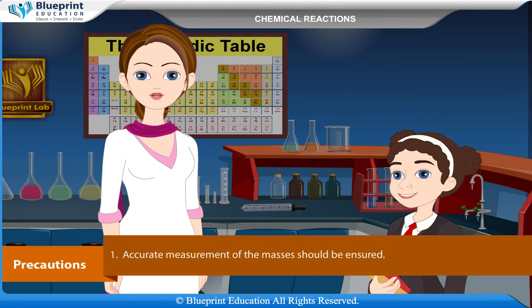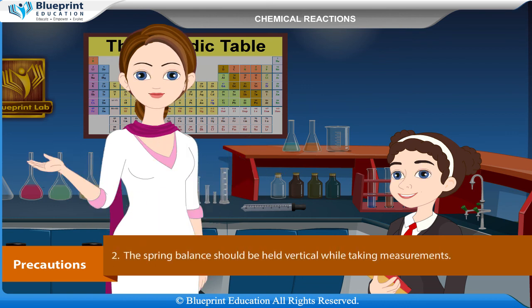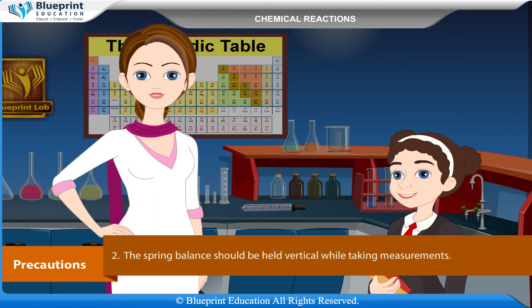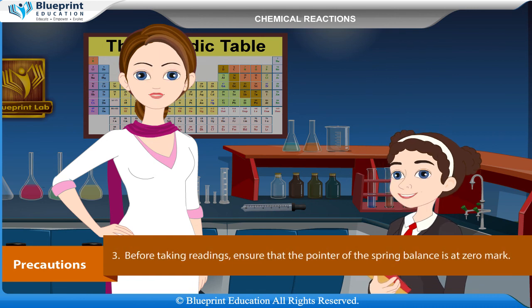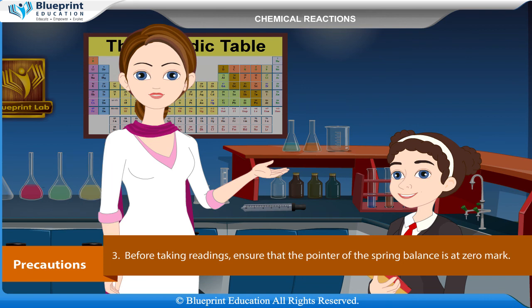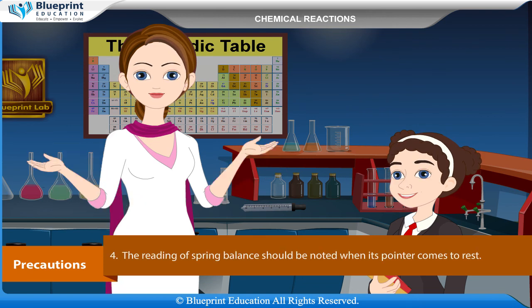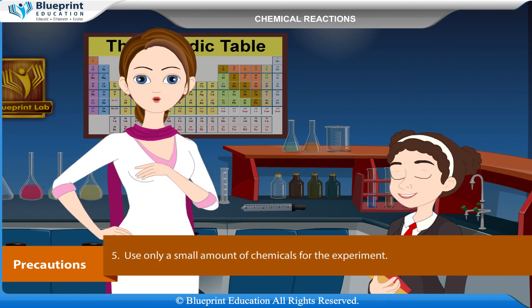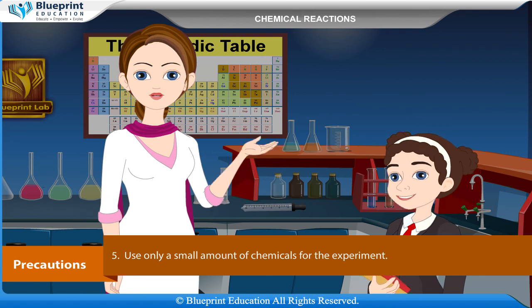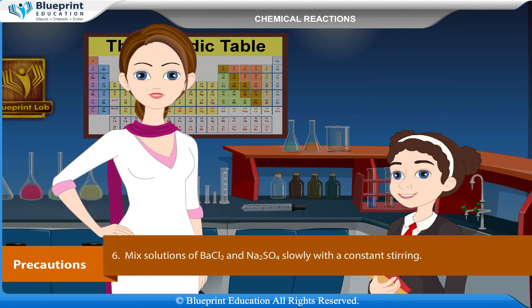Precautions: Accurate measurement of the masses should be ensured. The spring balance should be held vertical while taking measurements. Before taking readings, ensure that the pointer of the spring balance is at zero mark. The reading of the spring balance should be noted when its pointer comes to rest. Use only a small amount of chemicals, and mix solutions of barium chloride and sodium sulfate slowly with constant stirring.